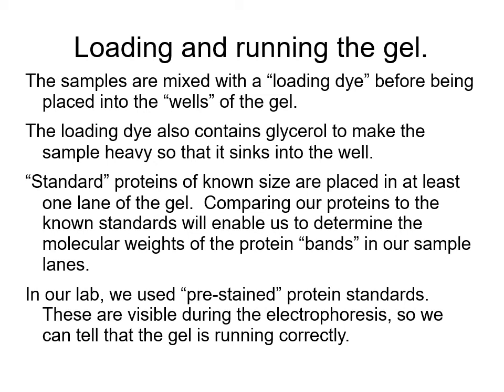So in our lab, we use pre-stained protein standards so we could actually see them during electrophoresis and know that the gel was running correctly.